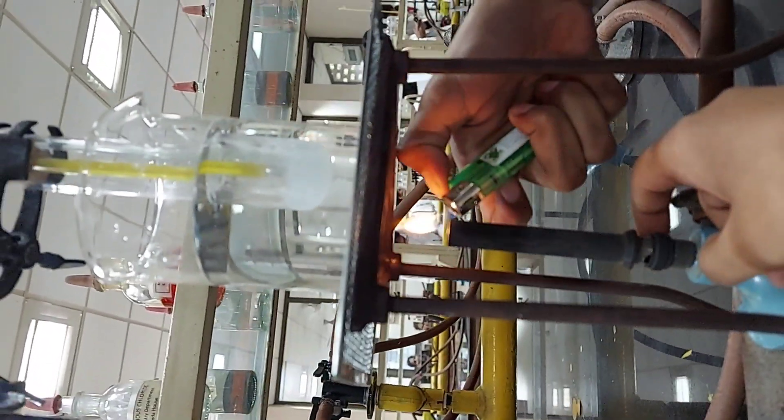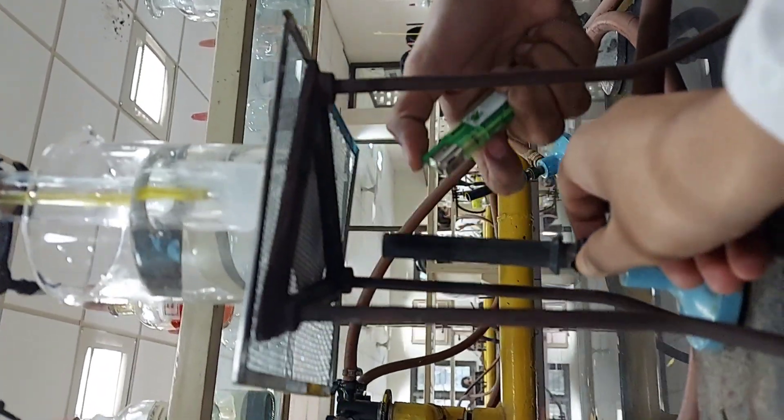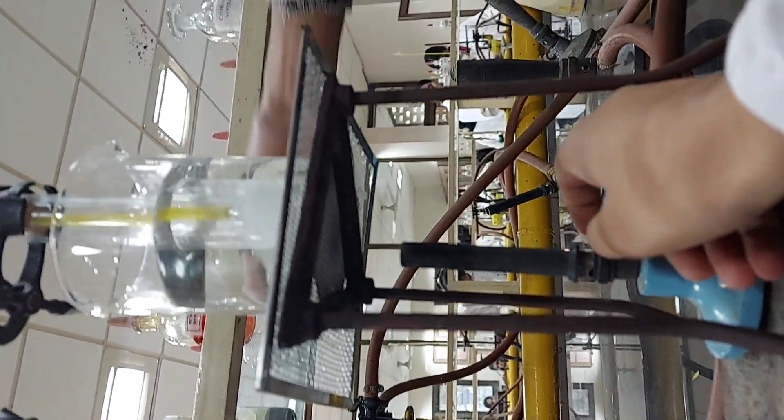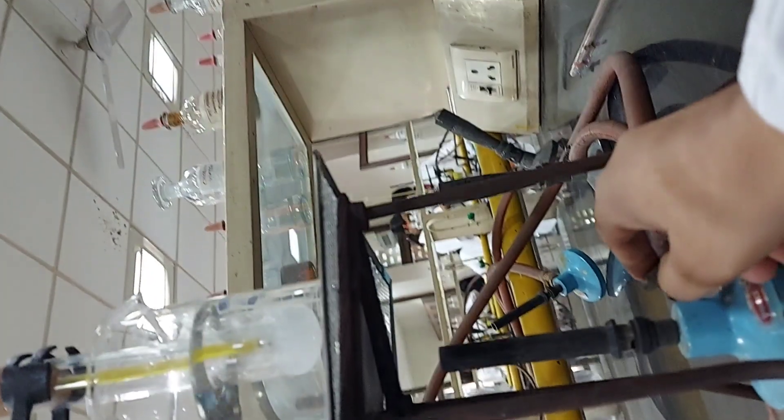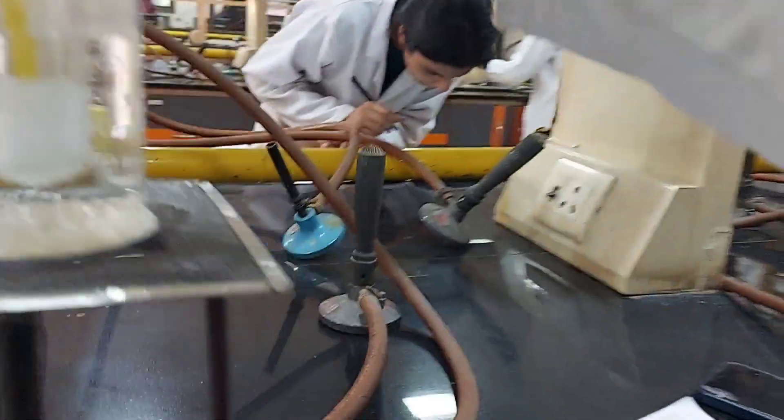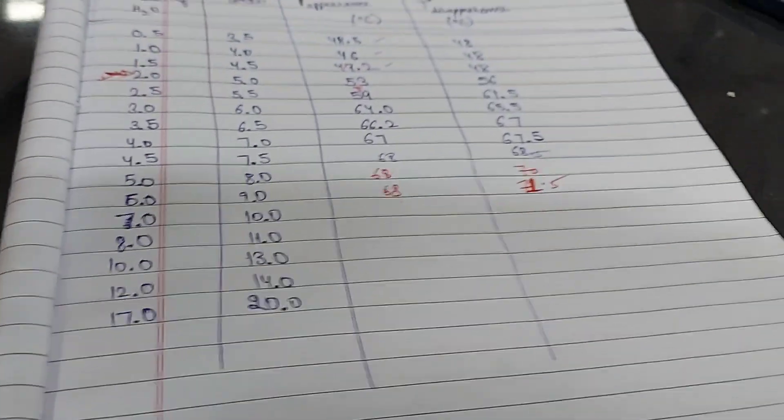So we have two types of temperatures: one when the turbidity disappears and again when it reappears. We take the average of these values and plot a graph of the miscibility temperature versus the mass percent of phenol.